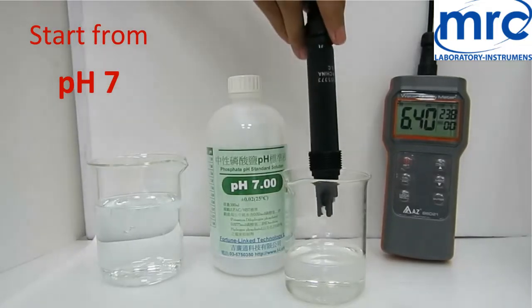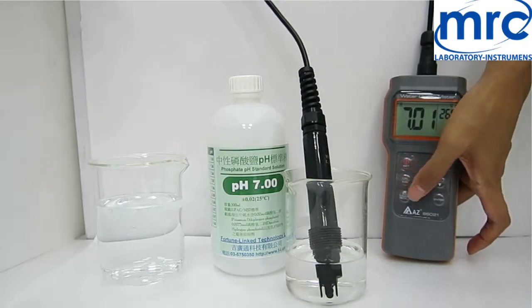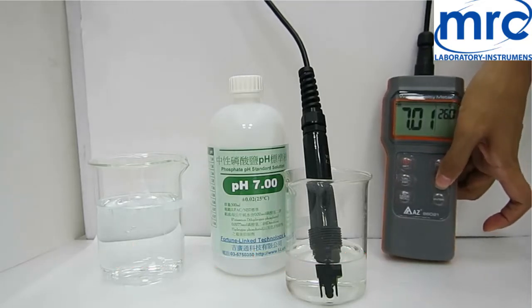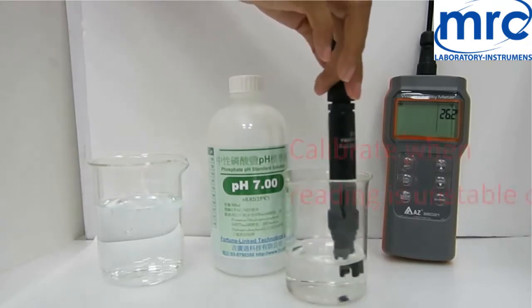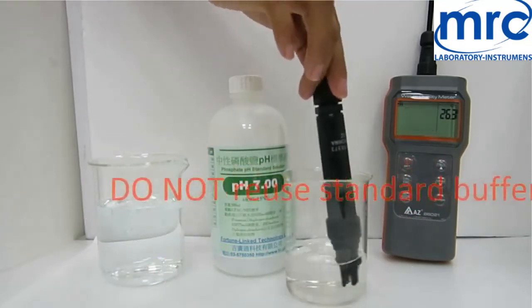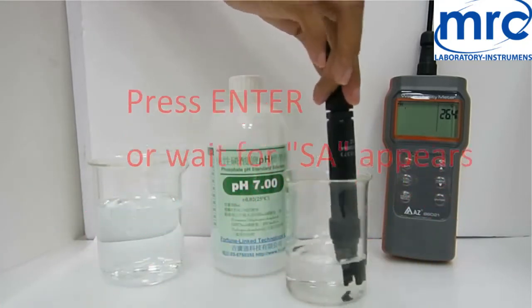pH calibration — start from pH 7. Long press Cal to enter calibration. Set the standard value using the up and down keys. Use a transparent container and make sure the pH electrode is completely immersed in buffer. Stir gently to get a homogeneous condition. Calibrate when the pH reading is unstable or incorrect. Do not reuse standard buffer. Once the reading stabilizes, press Enter or wait for the SA icon to appear when the result is automatically saved.